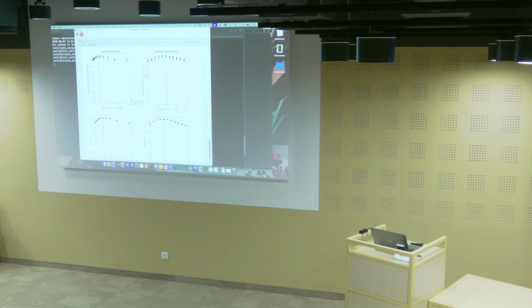So there's different methods. Here we have methods that basically compare the difference map. So we have our Fourier difference map, which is what we call the real truth. It really shows the difference between the two states. And then we have all these extrapolated difference maps calculated with a different occupancy. And we assume here that the difference map which resembles that Fourier difference map the most will be the best alpha value, so will be calculated with the best occupancy.